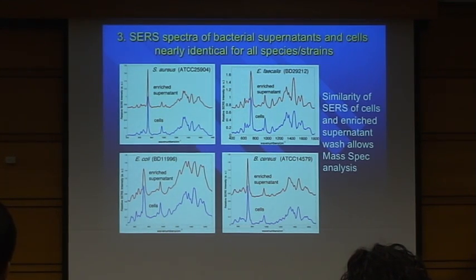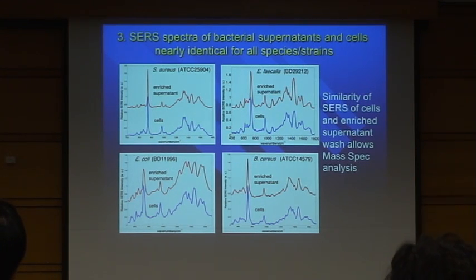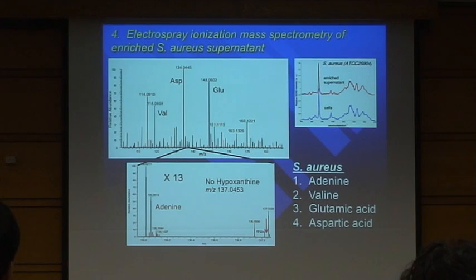They're water soluble small molecules giving rise to these signatures, not the cell wall. And that's frankly what I had told people for many years about this work, that there are unique cell walls that give the signatures, and that's what's mostly in the literature. That's wrong.